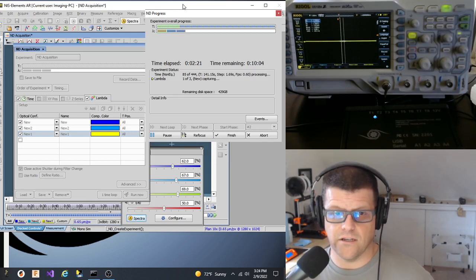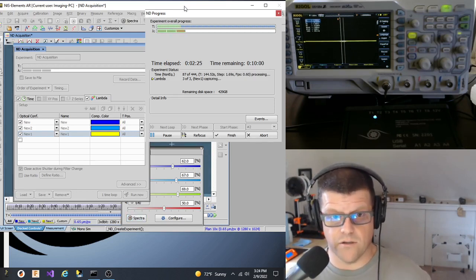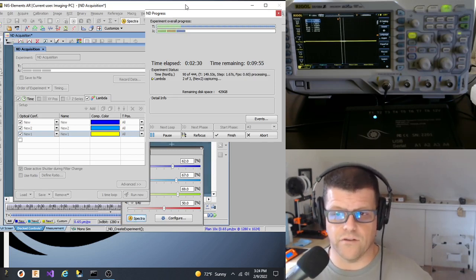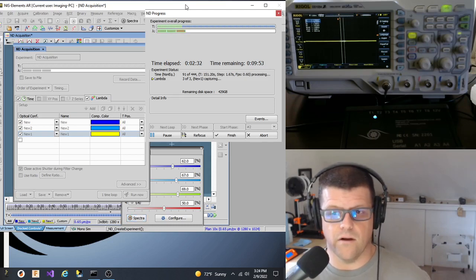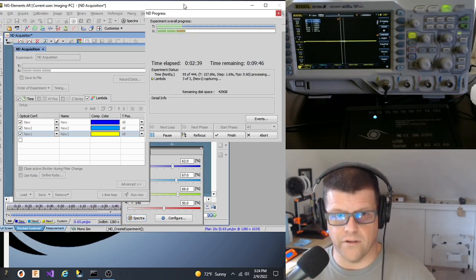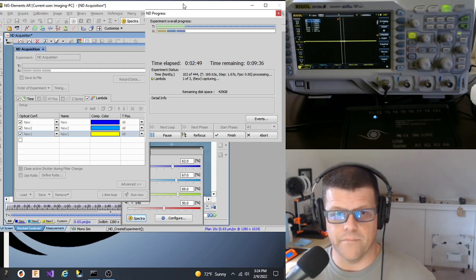In essence, this thing could control all of the illumination components or even some stage components natively, and then you don't have to have a super complicated control scheme on your backend software or your host PC software. So I think it's got a lot of possibility, and really the limit is going to be the diversity of challenges that people bring up to see whether we can use this thing to solve those challenges. Yeah, I'm hoping that this is a sufficient introduction.